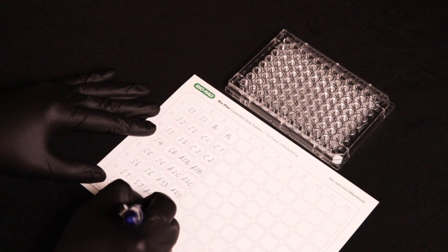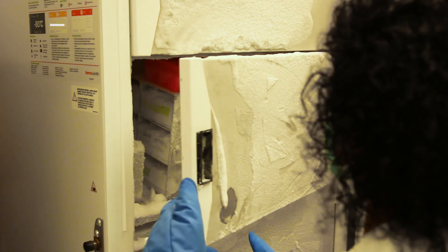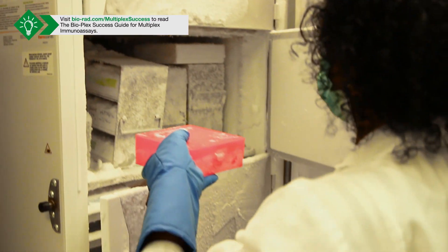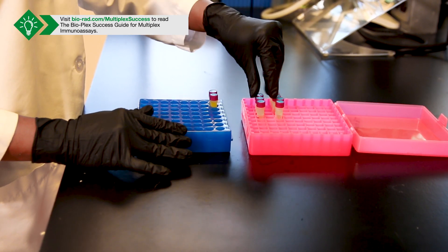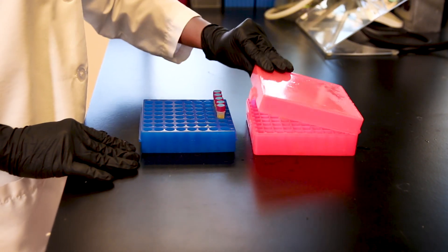Always run your standards, blanks, and samples in duplicate or triplicate. Move the samples to another standalone box or rack in the freezer. This step will make it easy to remove the entire box or rack when it is time to run the assay instead of sorting through the samples.